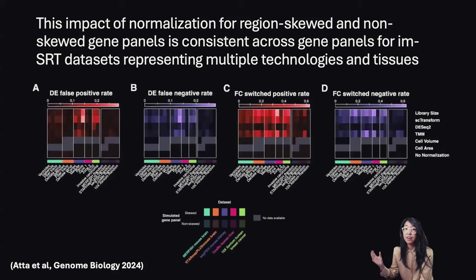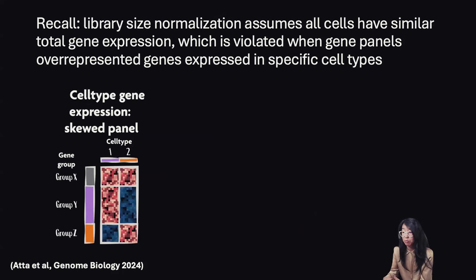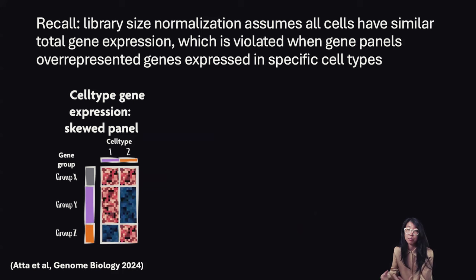It's worth noting that non-skewed gene panels do not exhibit this type of false error rate in terms of false differential expression and fold change switches. Likewise, normalization methods that don't consider the total number of genes detected — such as cell volume normalization — are not impacted by these skewed gene panels. This is all very expected because library-size normalization assumes that all cells have similar total gene expression, which is violated when gene panels over-represent genes expressed in a specific cell type or specific tissue region.